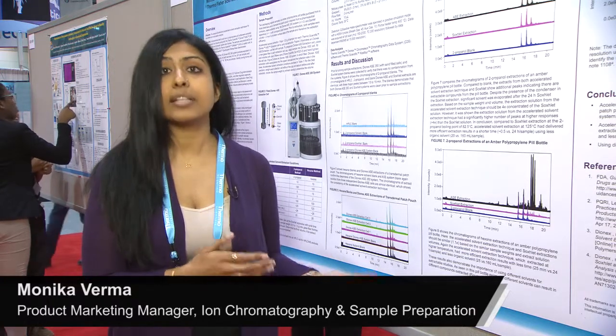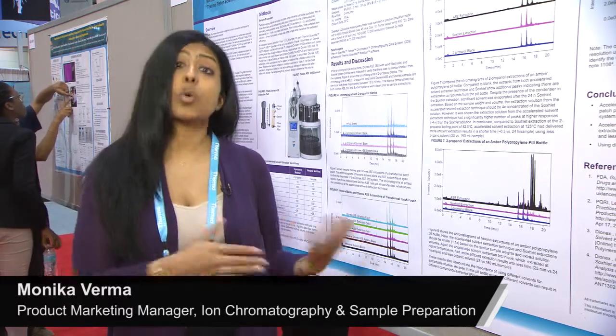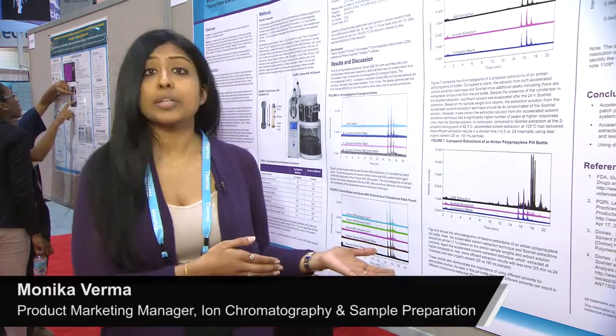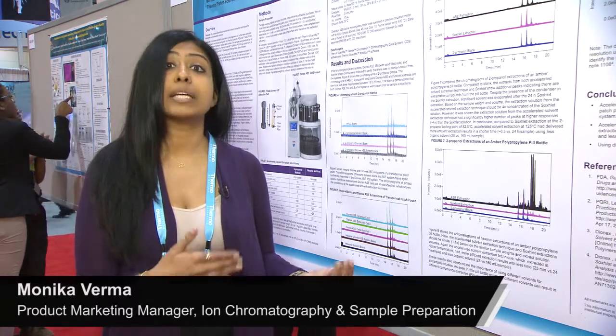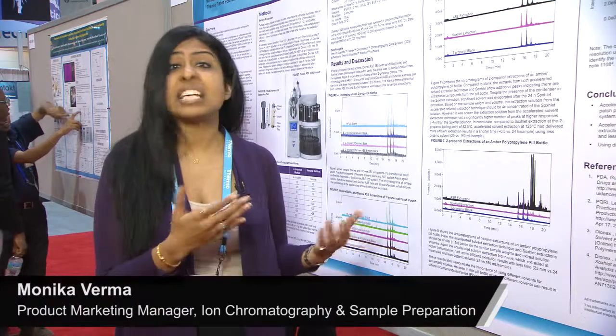In this method, accelerated solvent extraction delivered much more efficient extractions, or a comparable level of extractions, in less time using less solvent. The other thing the results have demonstrated is that it is necessary to use multiple solvents so that more unique compounds can be extracted. Using accelerated solvent extraction, you're basically performing extractions of less than 30 minutes per sample with less than 30 mL of solvent per sample as well.